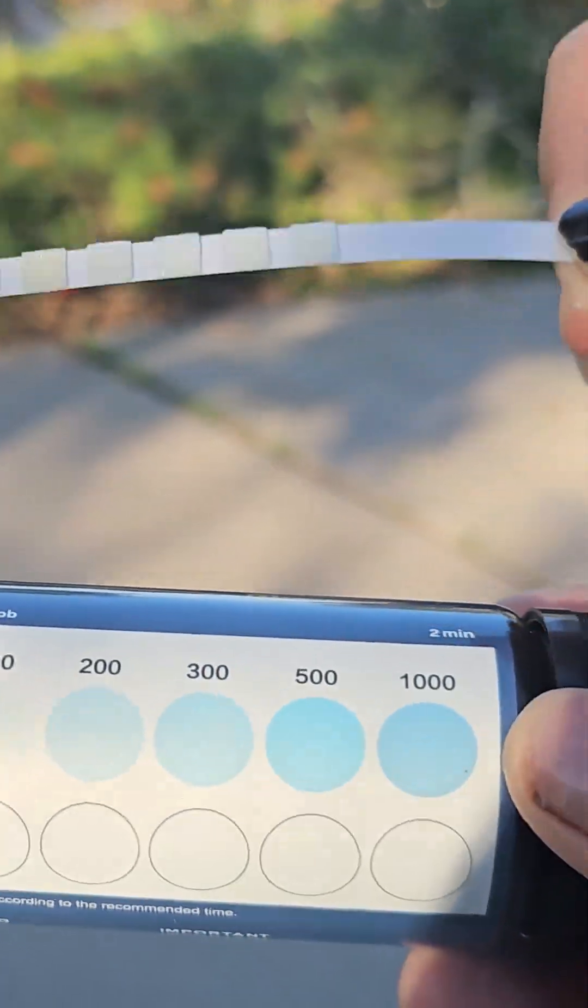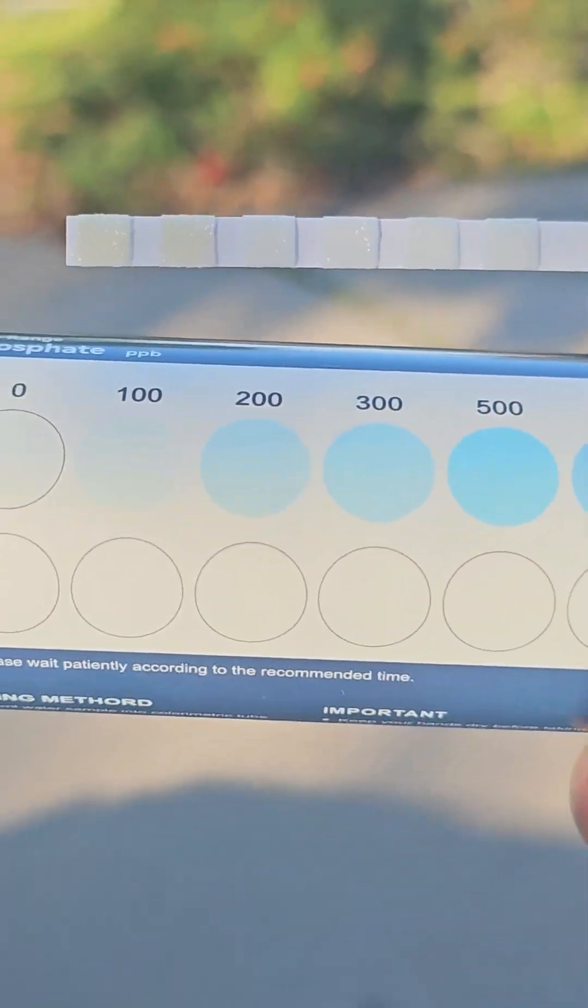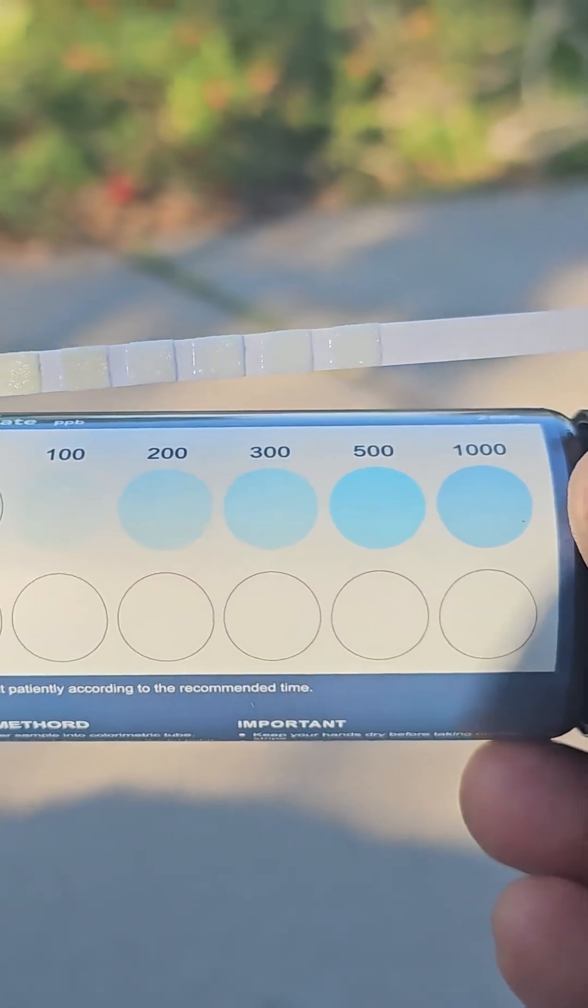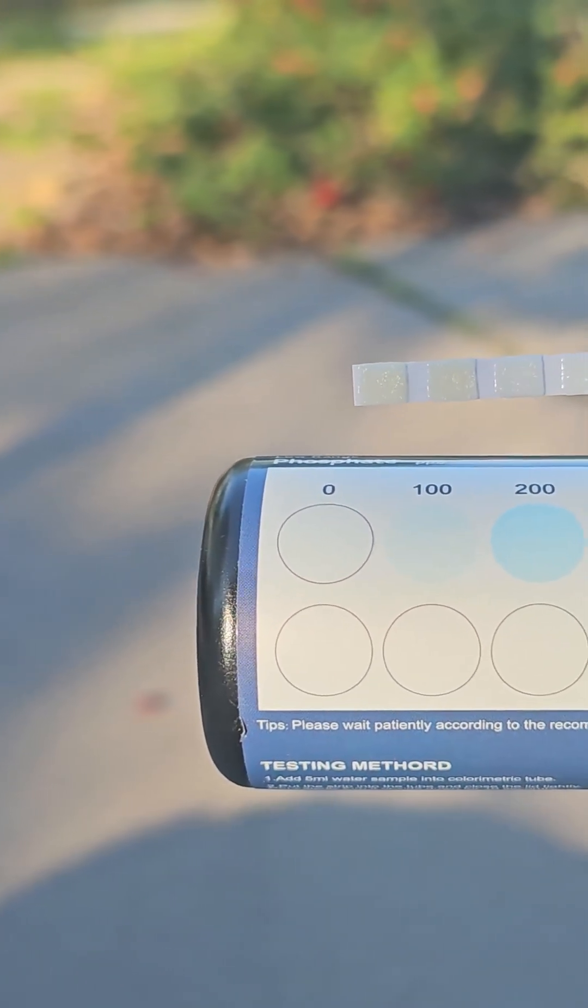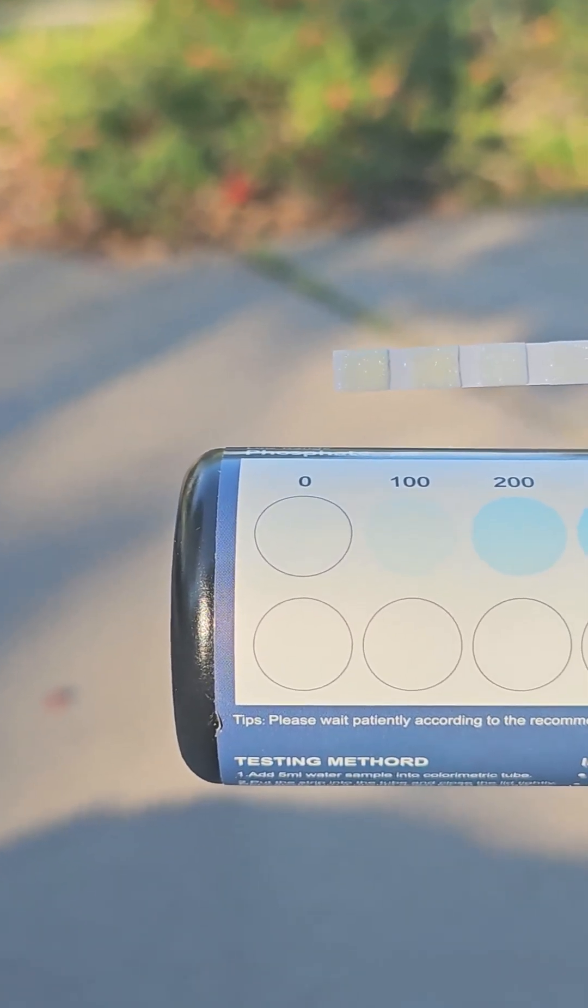Now we're going to compare the actual strips to see the actual chemical reaction. Right now we're looking at a little bit more yellowish than the hundred, if you guys can see. You can tell the change in color.